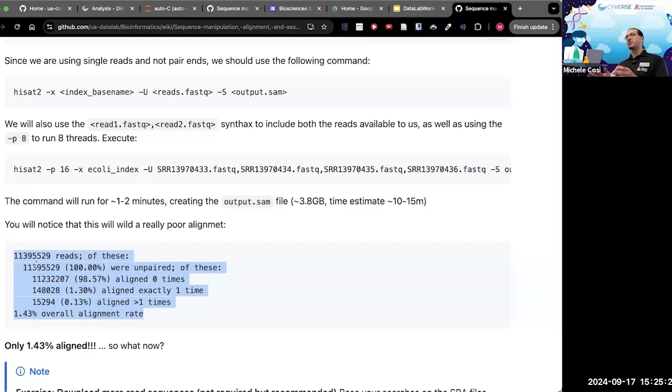But here's a question for people here, people online. Why do you think the alignment was poor? And overall, what can we do with this? Yes. What's usually considered a good alignment? Like what range? I like alignments that are above 90 to 93%. Anything above that, great. 95%, super great. 98%, 99% is God tier. 79 is something that I would not really think is good. In the paper, their alignment is 79%, which is, you know.